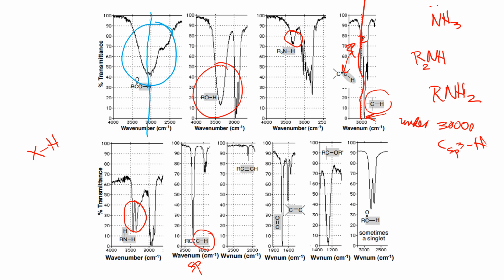And here we have other bands that are actually not with hydrogen. All of these were marked before with hydrogens. Now this is carbon-carbon triple bond, carbon-carbon double bond. Important here that when you go to double bonds, the carbon-carbon double bond is less intense than the carbon-oxygen double bond. Remember that this has to do with dipole moment. The higher the dipole moment, the more intense the band is. The band with alkenes may disappear if this is substituted symmetrically. If you have 4 groups the same, then that band will disappear. So pay attention to that. But it's sharp, though not as intense as the carbonyl. The carbonyl can be wider. The alkyne is also sharp and not as long.